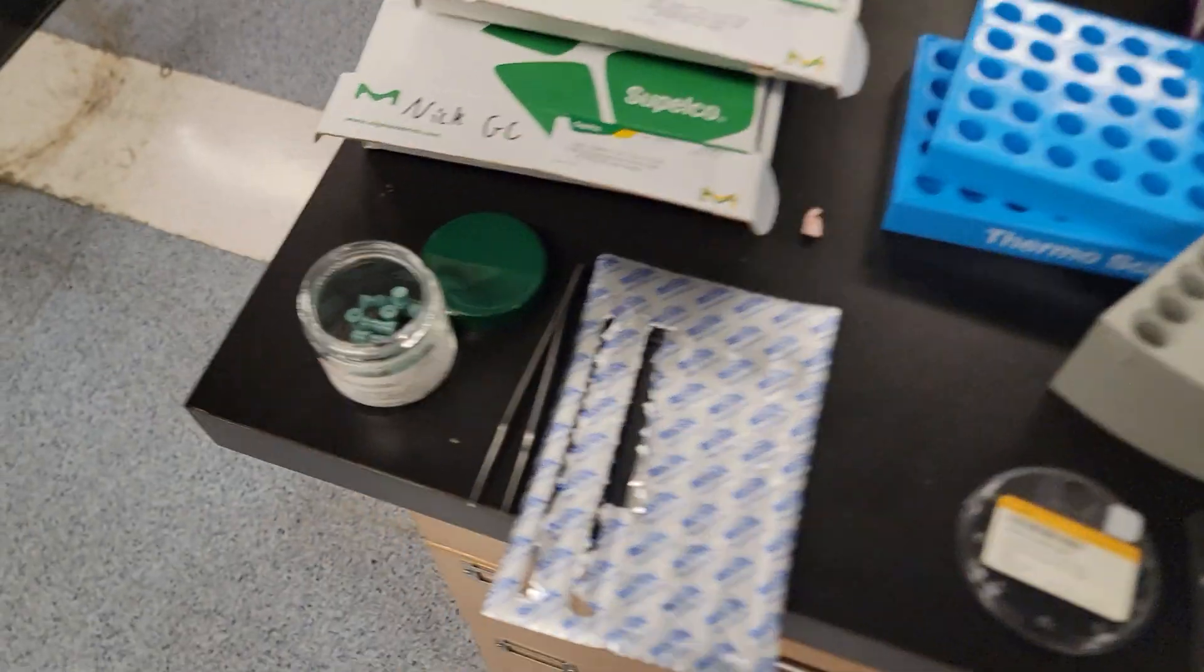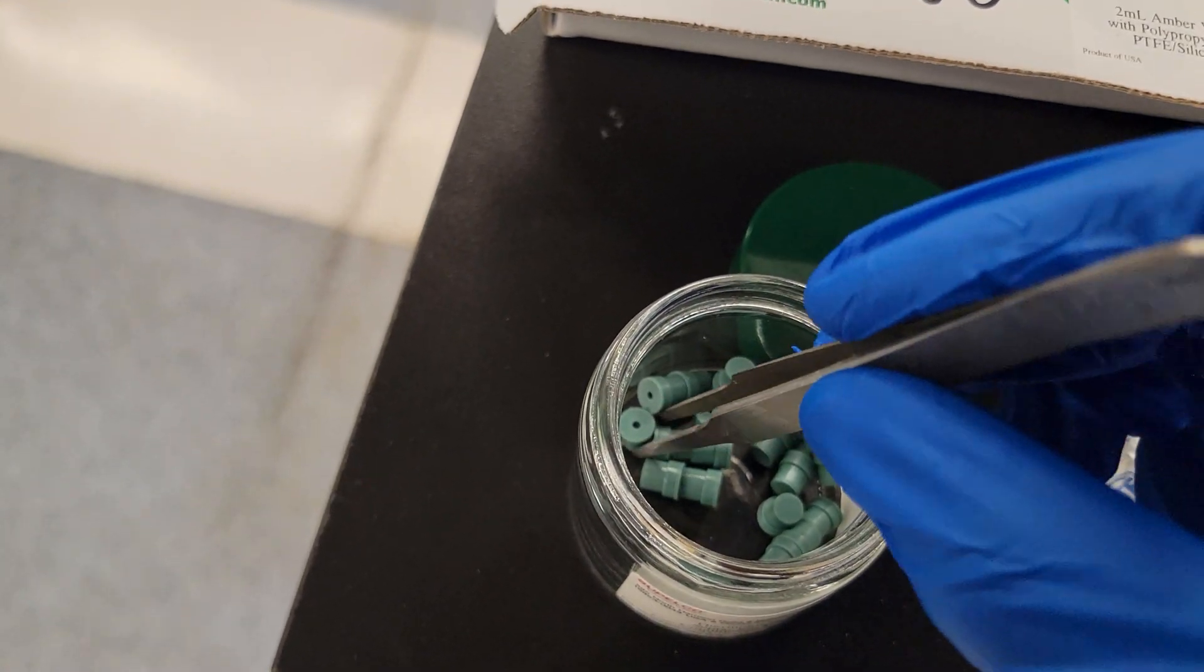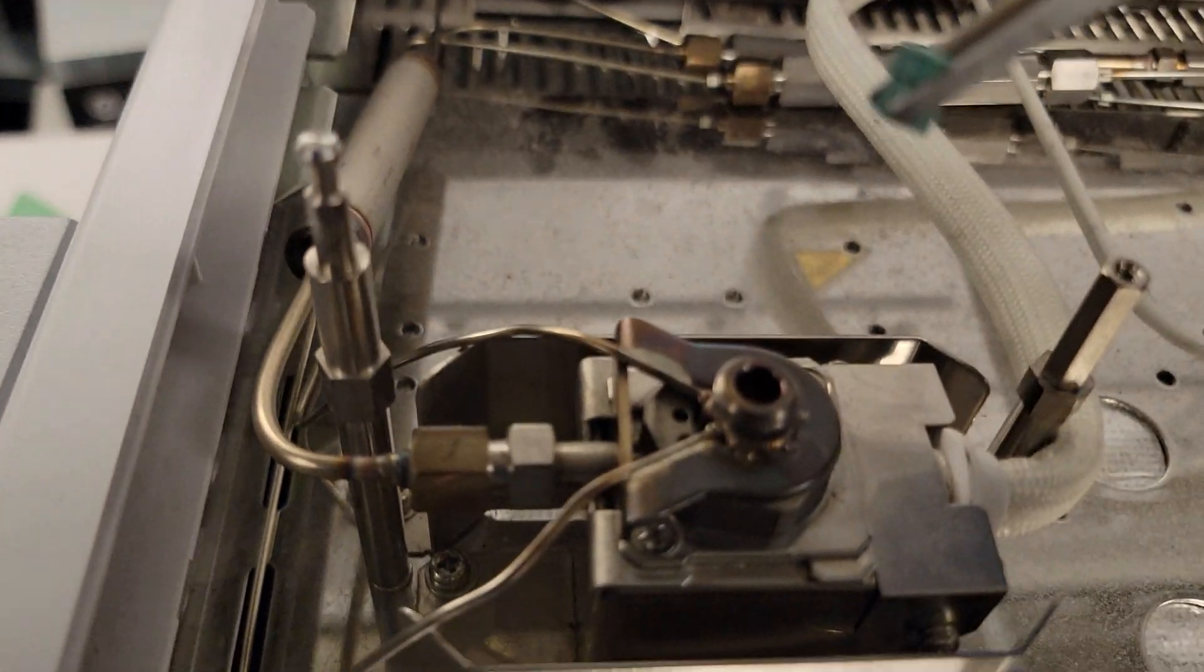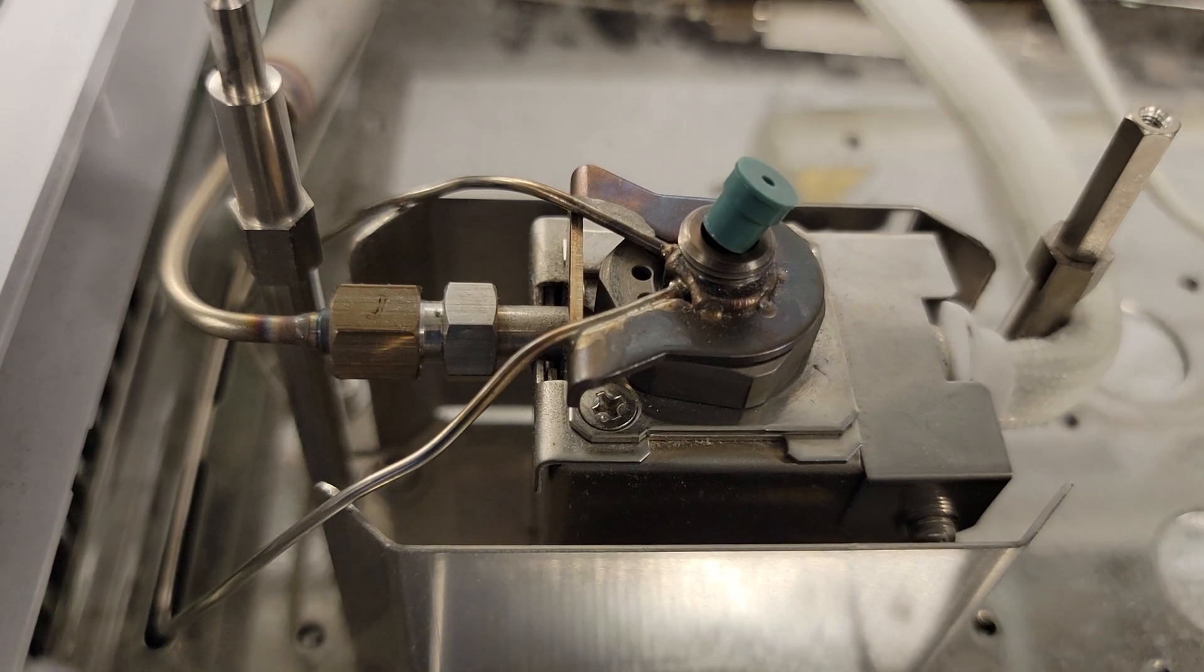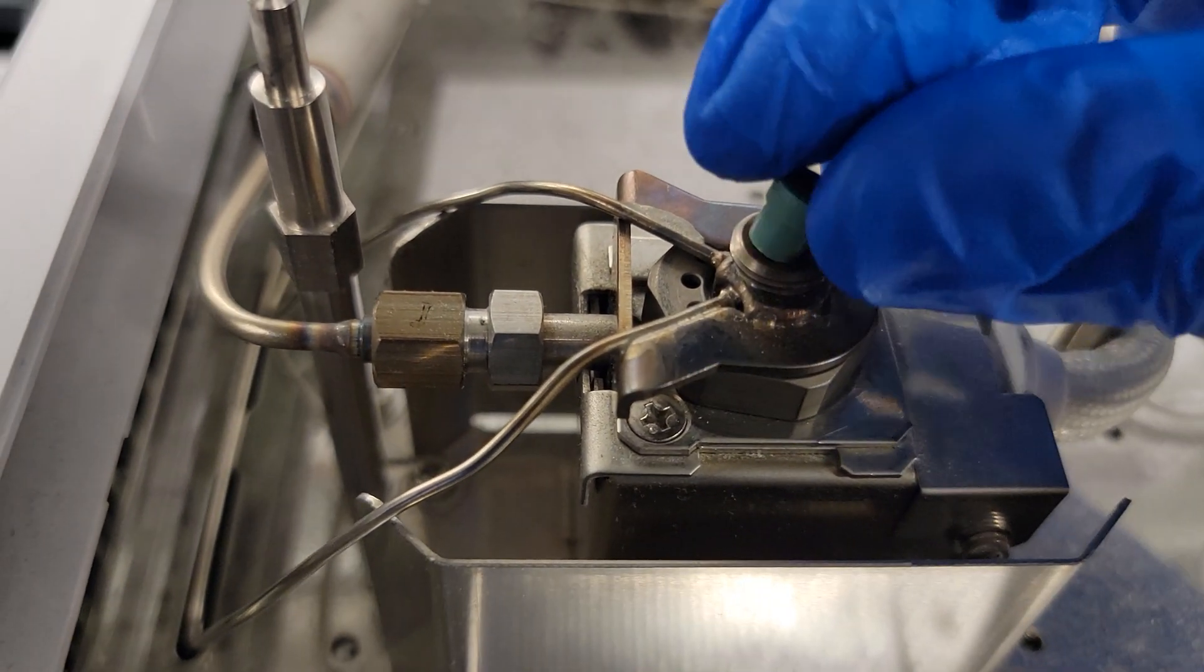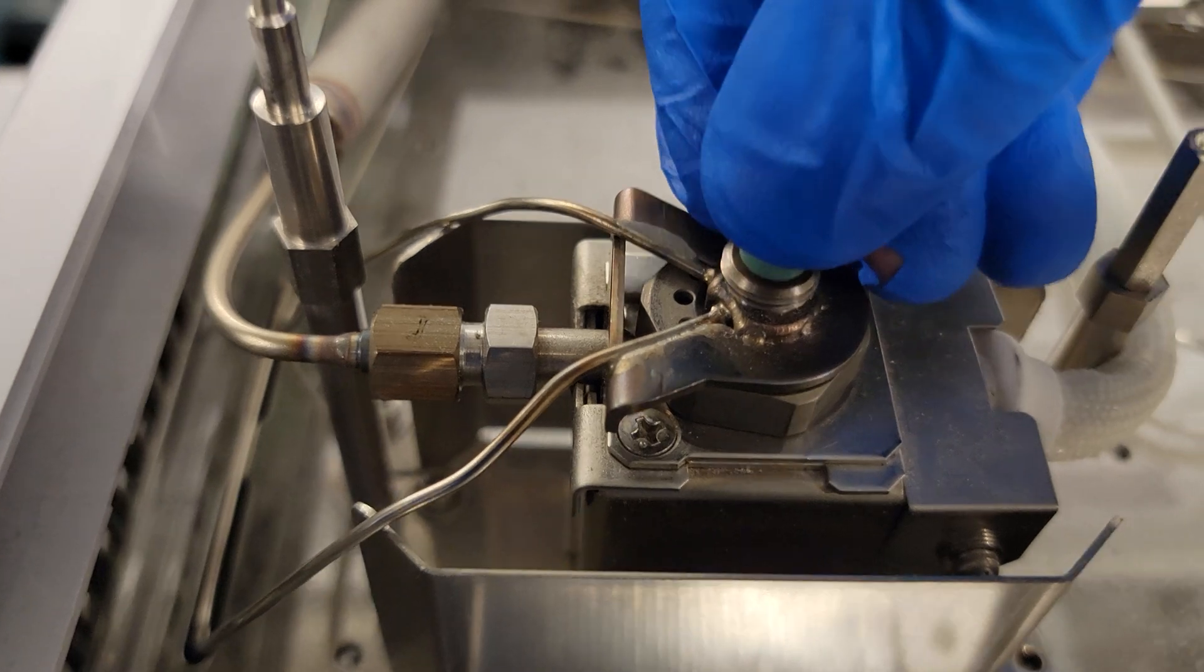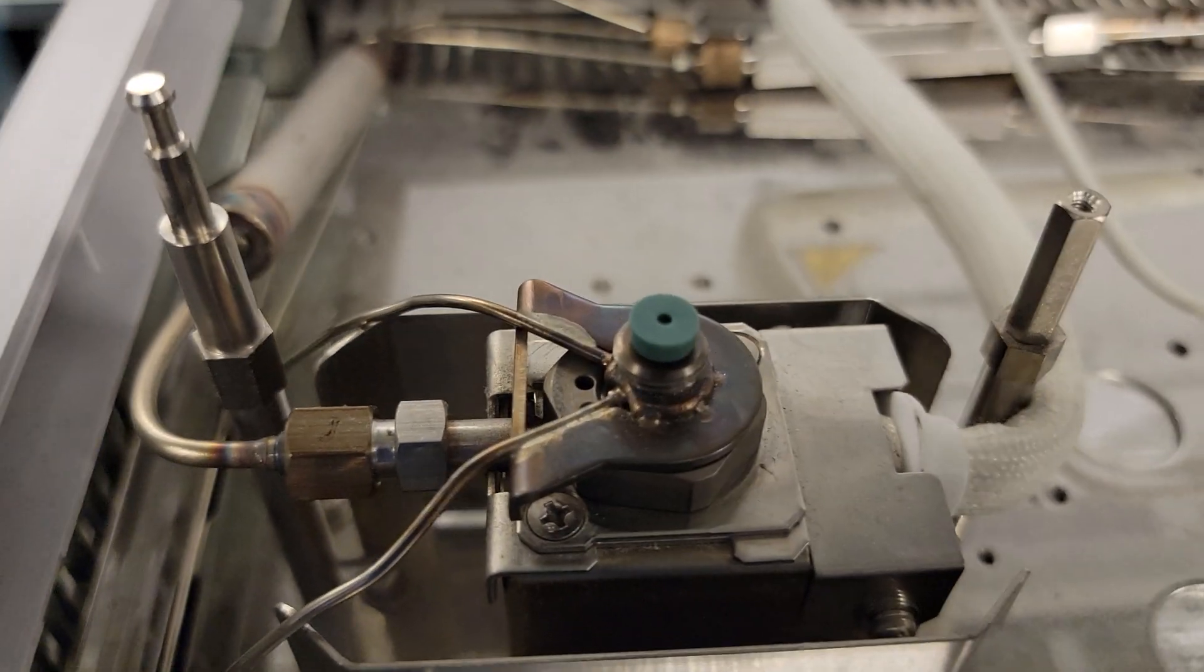We're going to take one of these new septa. I'm going to use tweezers just to make it easy - they sort of get stuck to the glass. I'm going to take that out and put that in. You just want to push it all the way in, just like that, easy.